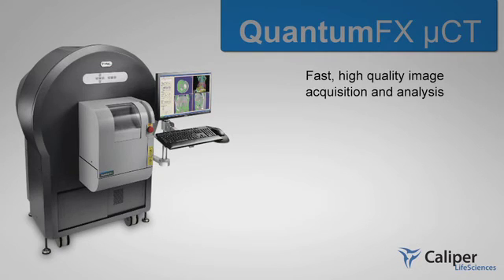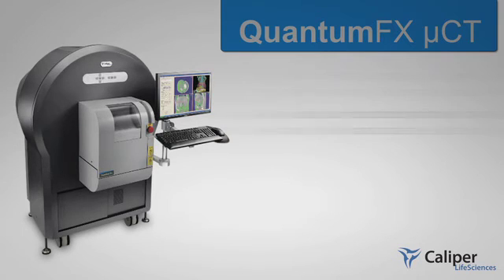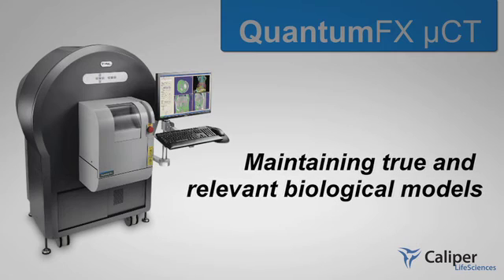Fast, high-quality image acquisition and analysis with low radiation doses for longitudinal studies. The QuantumFX is your micro-CT solution in maintaining true and relevant biological models.